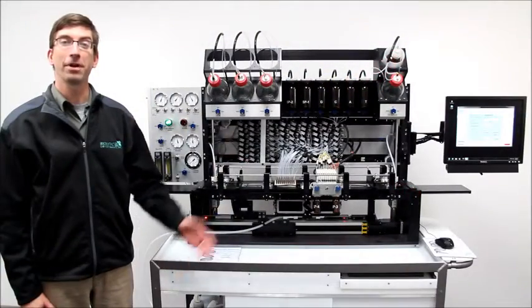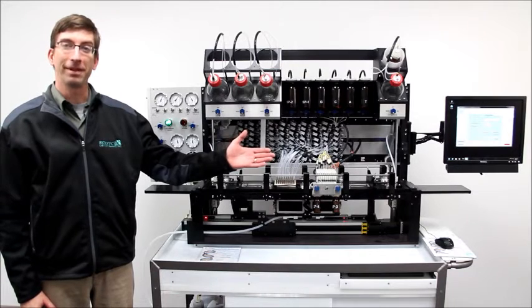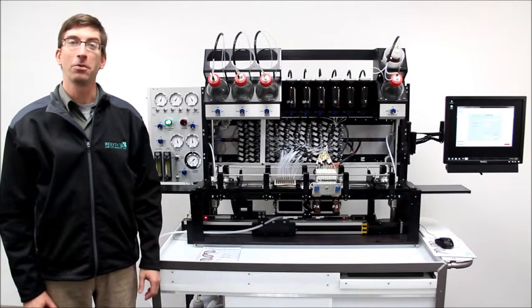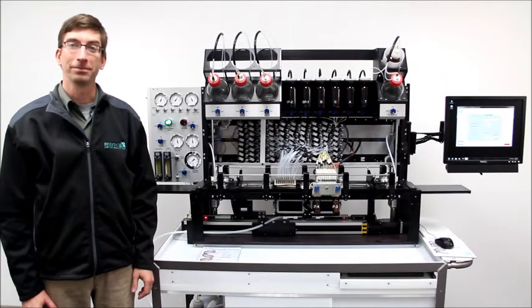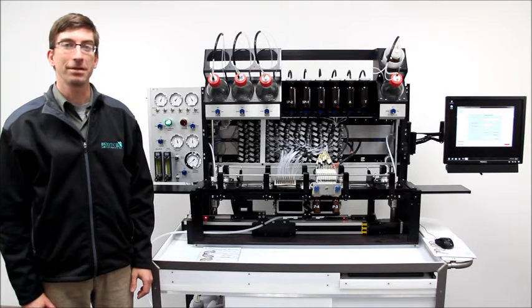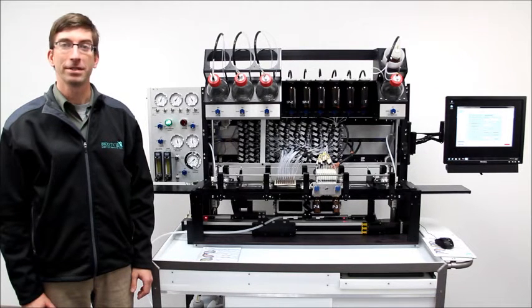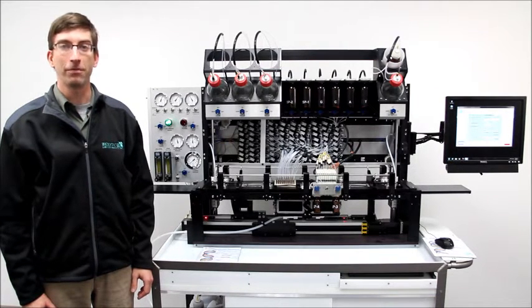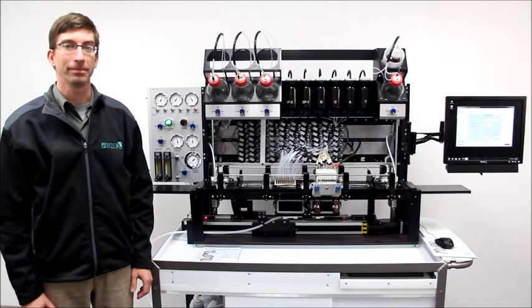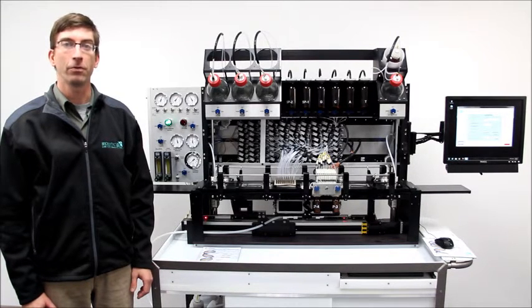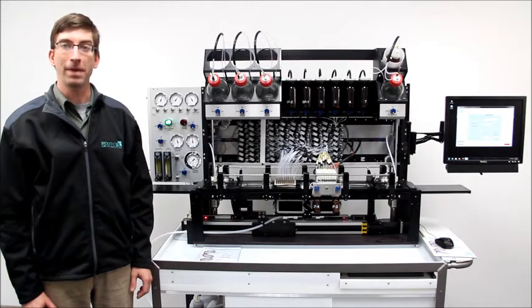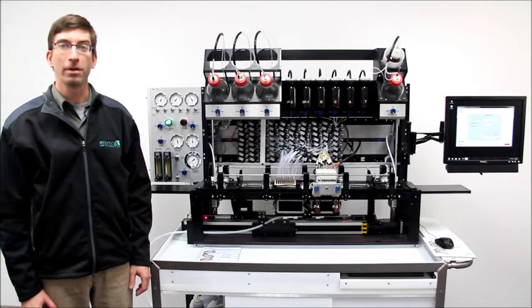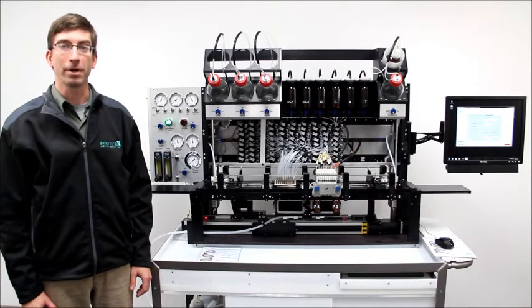Thank you for viewing our short video on the capabilities and operation of the Dr. Oligo 192. The Dr. Oligo synthesizer is also available in other models such as the 96, 384 and 768. Other instruments for oligo and peptide synthesis are available from Biolytic Lab Performance Incorporated.